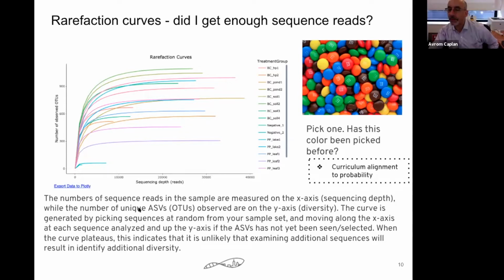Did I miss the part where we learned what the sequence similarity cutoff is for the OTUs? Okay, I didn't mention that. When you're using DADA2 or QIIME 2 through the Nephele pipeline, you're not getting an option to change that sequence similarity.